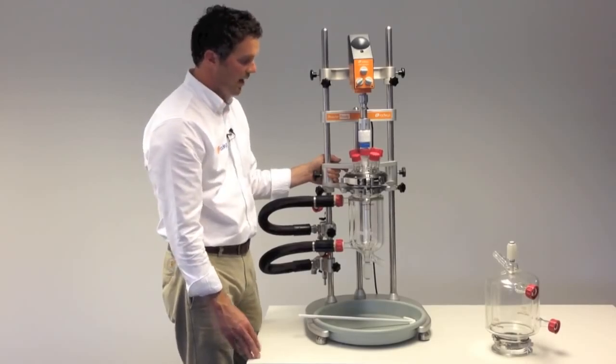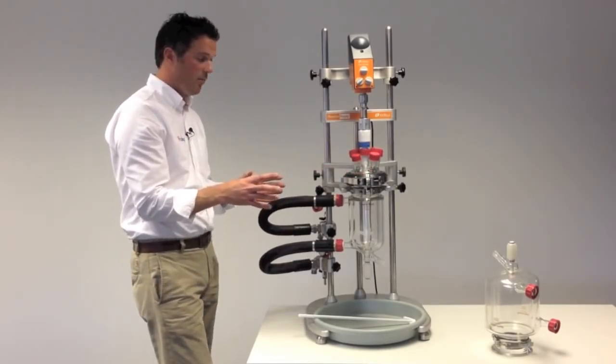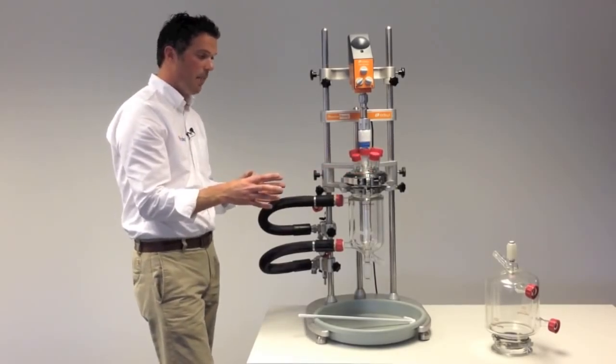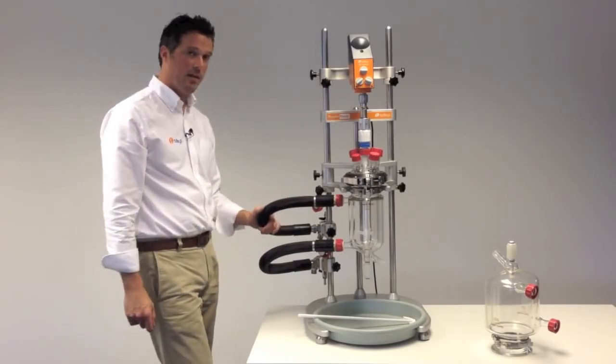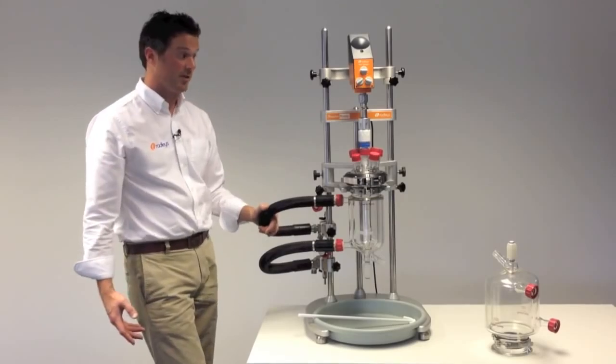Then there's the Reactor Ready Duo, which is the same but with two vessels side by side, so if you wanted to run multiple reactions at the same time, and the Reactor Ready Pilot that accepts vessels from 5 to 20 liters, so a larger system.